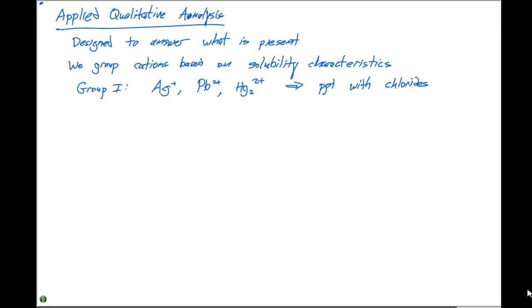In your typical laboratory scheme, we've taken out mercury, and it's rarely ever used in chemistry labs in the year 2011 because of its toxicity. But if your grandparents came to school at Ohio State, they got to play with mercury in labs. So it's one of the things that is still included in the scheme, and I would expect you to know this, and I'll give you some tips based on the Ksp tables of how to isolate these guys out.